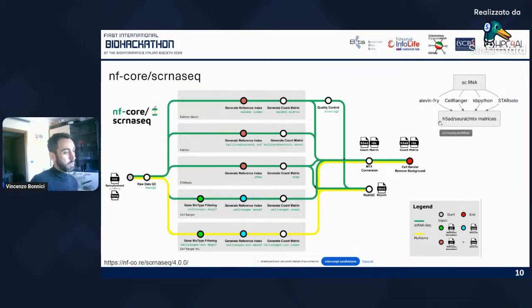It's a very specific format, but many tools that analyze bioinformatics data allow you to input H5. Or, however, you can have a specific format for the Seurat suite that you will see in the next webinar, or any other kind of format. You can run MultiQC at this time.